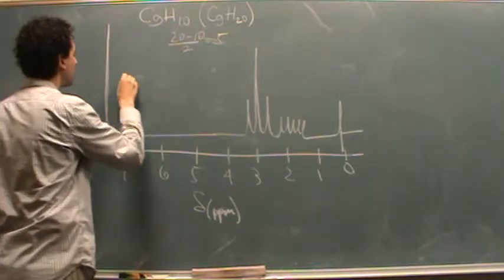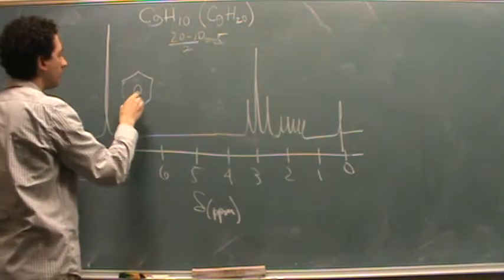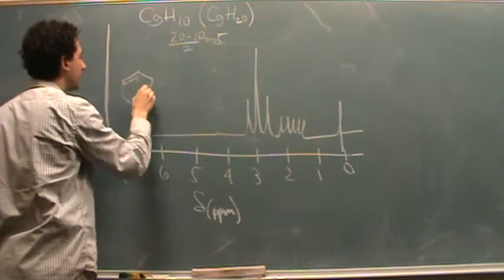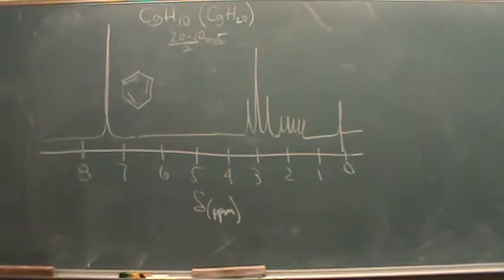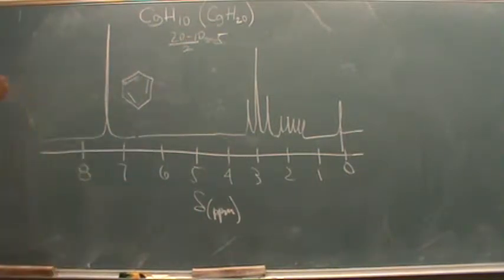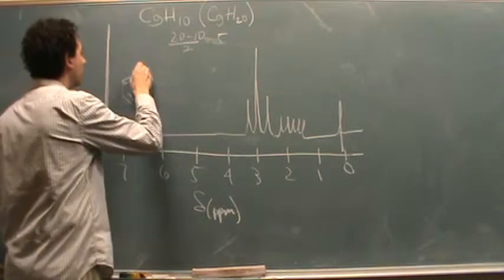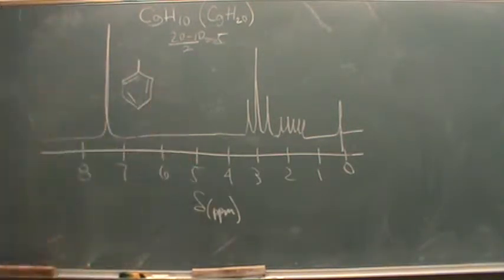If we have a ring here, like I suspect, remember there's 3 double bonds in here. Rings and double bonds each give 1 degree of unsaturation. So this has right now 1, 2, 3, 4. So there's actually 1 more degree of unsaturation, which will either be, again, another ring or a double bond. Okay? So who knows, this is either attached at 1 or 2 places.